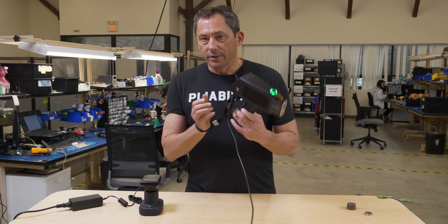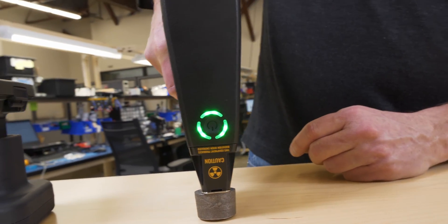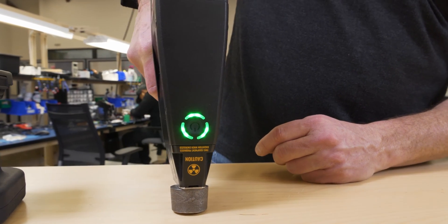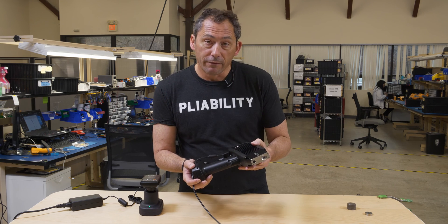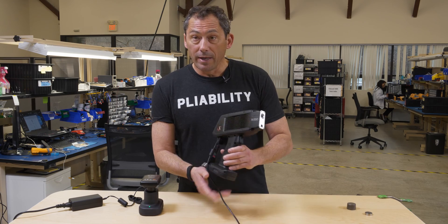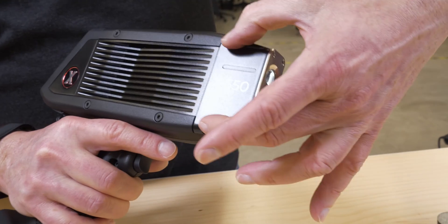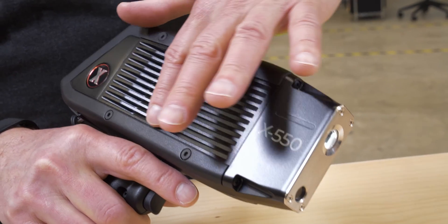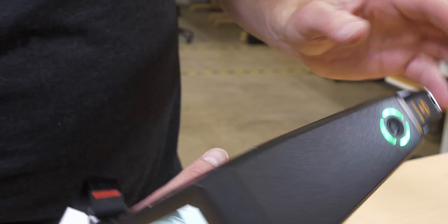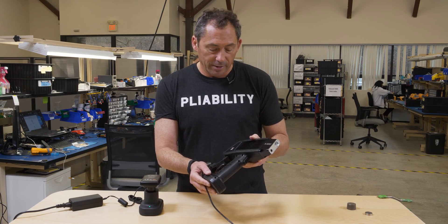So let me introduce this great new X550 XRF analyzer. This thing has just taken the market by storm — it's a beautifully designed analyzer. First of all, it's only 2.75 pounds, so it's the lightest XRF ever made. Despite that really lightweight design, it's got a mostly metal frame; the snout is metal and goes to a metal heat sink with all these fins. Not only does that provide strength and structural support, but it also gives great heat dissipation so you can use this thing all day long in virtually any climate.